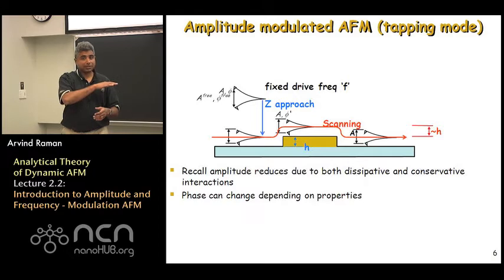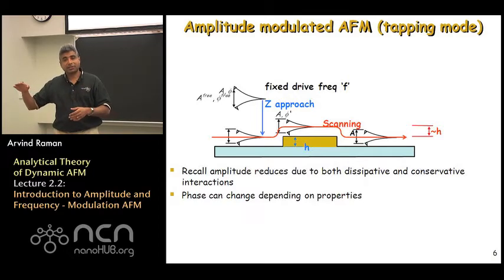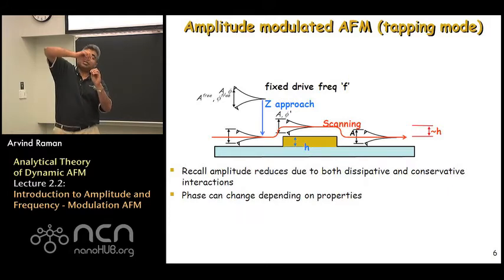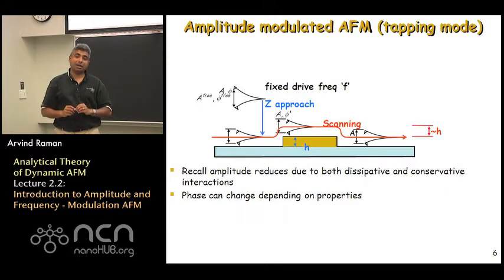So as a result, you can see as the cantilever is scanning over the sample, oscillating like so, when it hits an object, its amplitude would tend to decrease because there's less room to vibrate. But since we're measuring the amplitude and we find that the amplitude is less than the set point amplitude, the controller would adjust itself, move the base of the cantilever up in order to get the same vibration amplitude, and then you would keep scanning over the substrate.